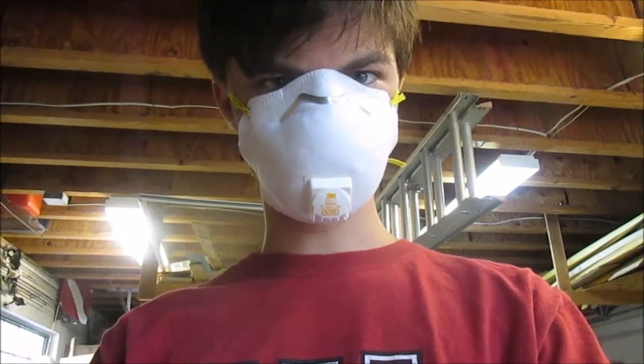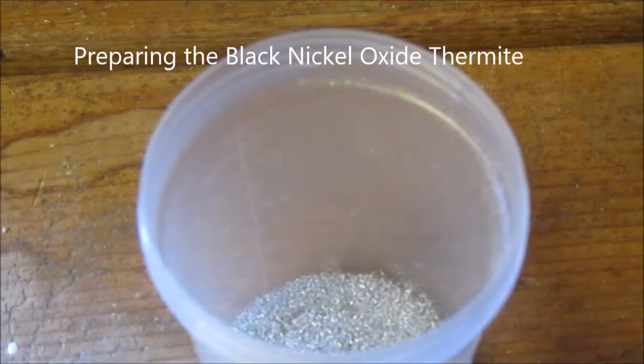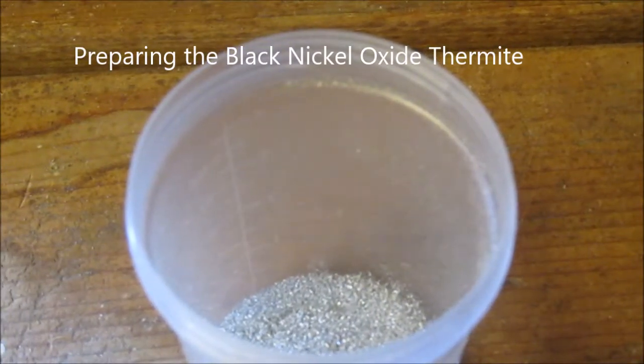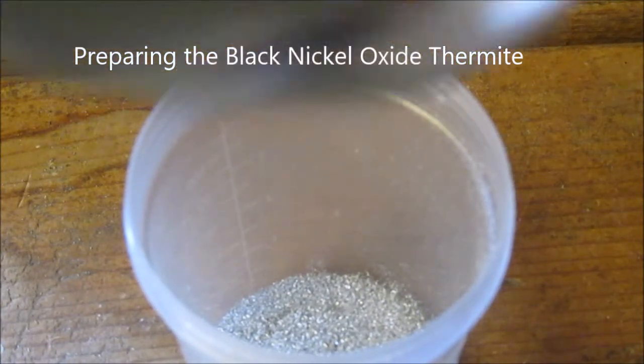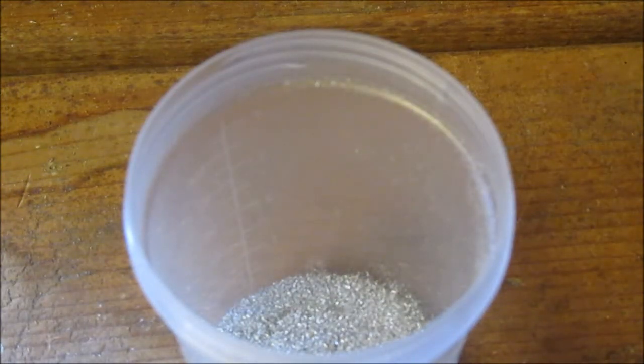That's why you shouldn't become a logger. Boom — face mask. Okay. There's my last sample of magnesium. And now I'm going to use Jerry the Science Spoon. Put some black nickel oxide in it.